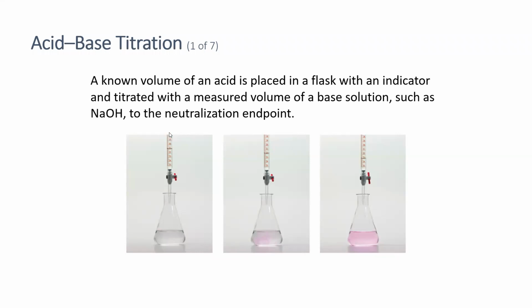This is a burette, and inside of it was placed aqueous sodium hydroxide. So a solution of known molarity sodium hydroxide would be placed inside this burette. But in our case, we're not going to be using this fancy equipment. It would be much too expensive to put that in your kit. So instead, we're going to use a Beral pipette, and we're going to be calibrating the volume of a drop using that pipette. So that's a way to avoid using the more expensive equipment that's shown in this picture here.